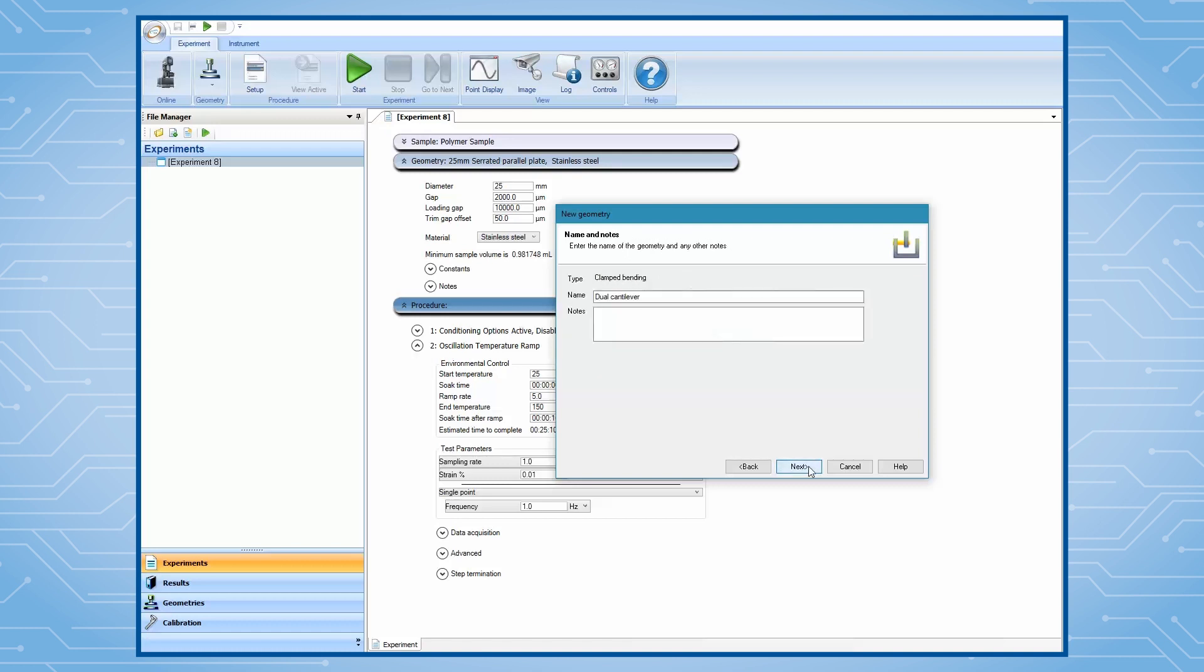Then simply click on Next in the next few pages, since we will be entering sample dimensions and performing clamp calibrations after the file is created.